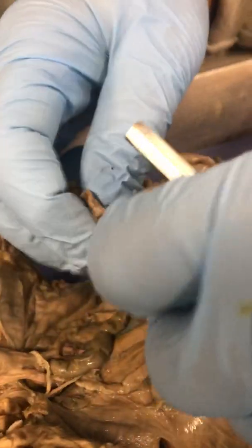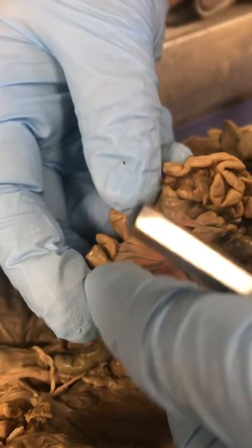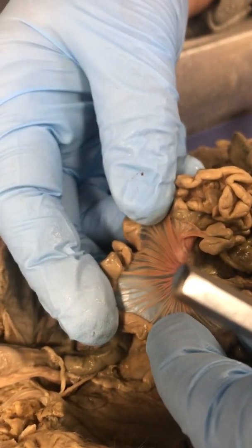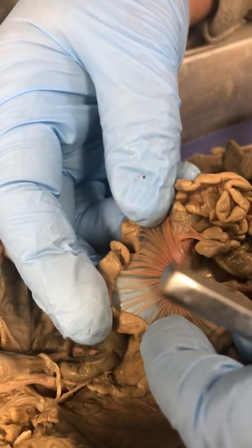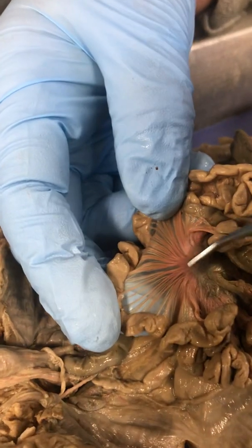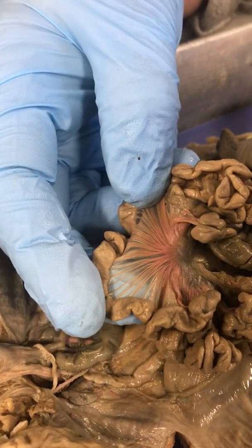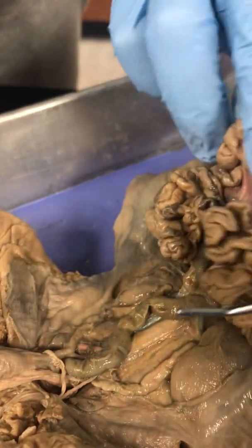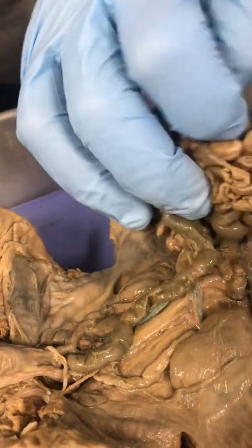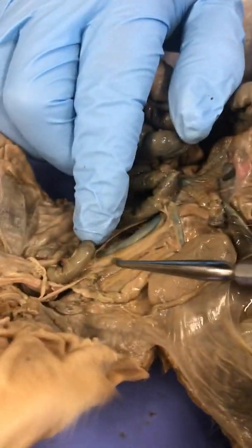The other thing about the small intestine, you can see this double layer of the peritoneum that comes off the wall and wraps around the small intestine, creating the mesentery. And you can see blood vessels projecting out, and these would be branches of the superior mesenteric artery. Then, of course, if we move this out of the way, you can see the abdominal aorta right here.